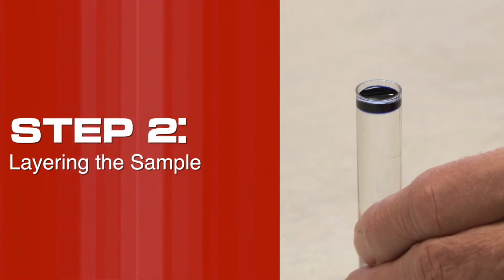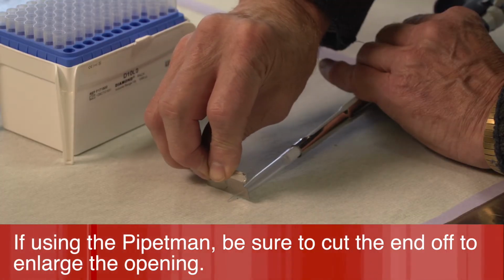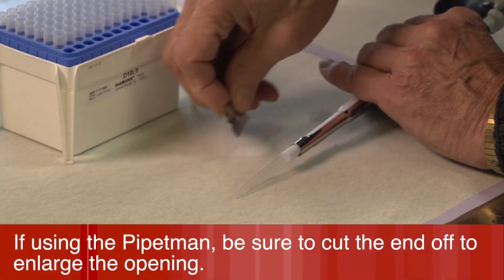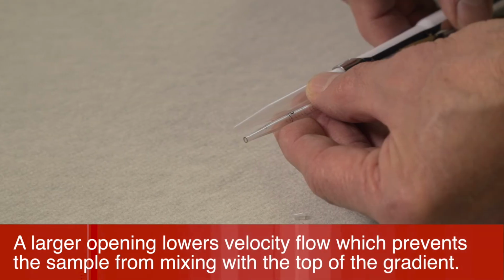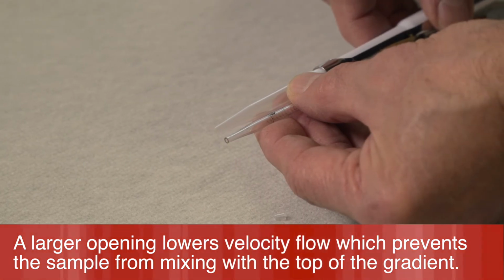Step 2. Layering the sample. Samples can be layered with either the sample layering device we provide or a pipette man. If using the pipette man, be sure to cut the end off to enlarge the opening. A larger opening results in lower velocity flow, which prevents the sample from mixing with the top of the gradient.